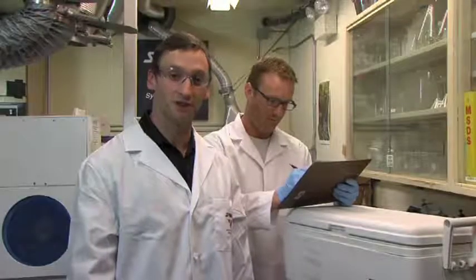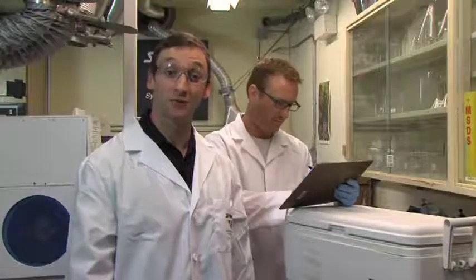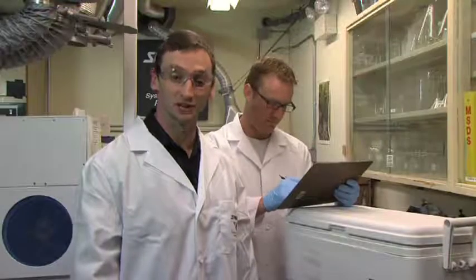Upon receipt of the sample, the laboratory custodian signs the chain of custody form, makes copies of it for the laboratory records, and returns it to the owner of the samples. If we'd shipped the samples by commercial carrier, the lab would have faxed the chain of custody.